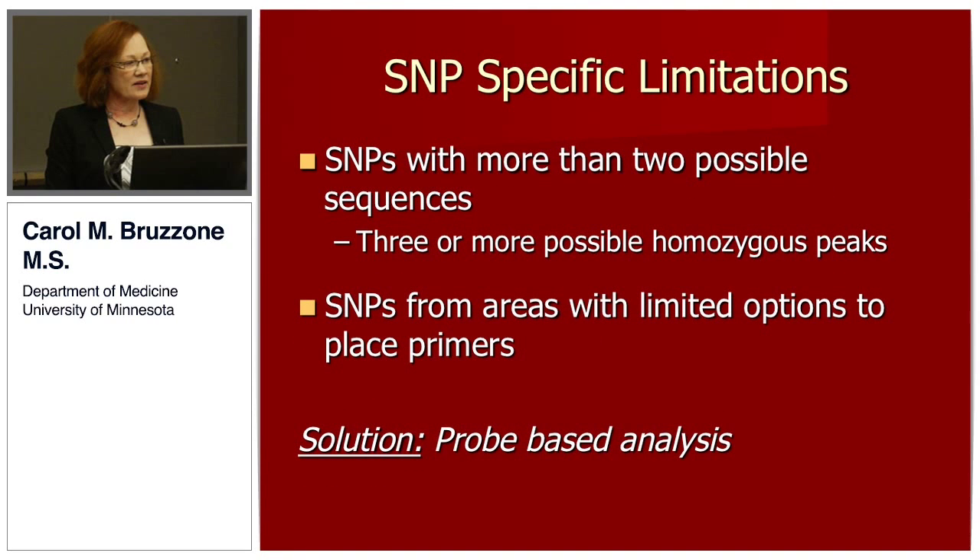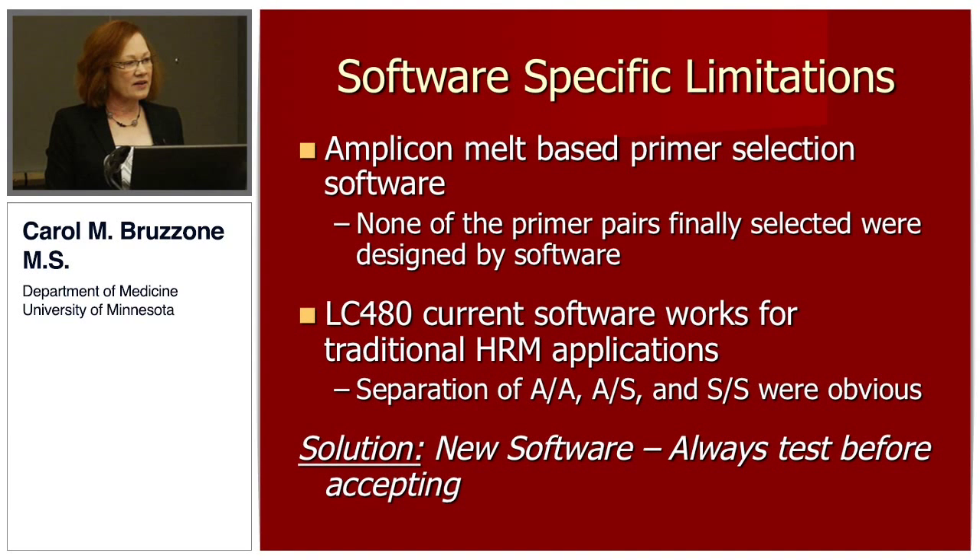There were some limitations to this assay — it's not going to work for everything. There are SNP-specific limitations: we ended up assaying for eight SNPs, and had two more in consideration. One had more than one minor allele, and we didn't feel we could accurately separate three possible homozygous peaks and all possible heterozygous peaks, so we deleted that SNP from this type of measurement. We also had one SNP buried in a nonsense AT area with no satisfactory primer placement options. For both of those SNPs, you need to go to a probe-based analysis, though the unique outcomes will not be available.